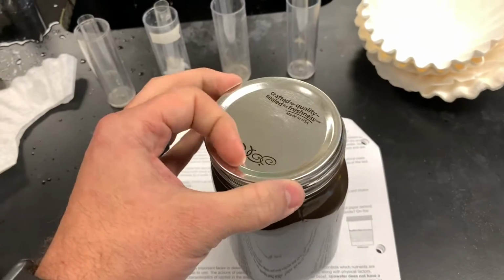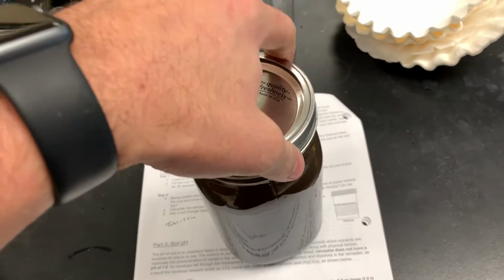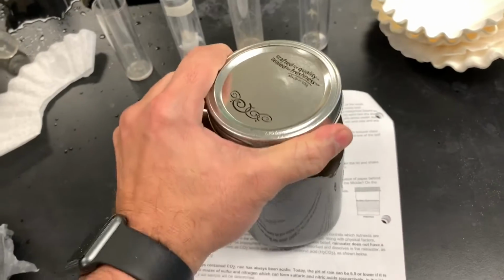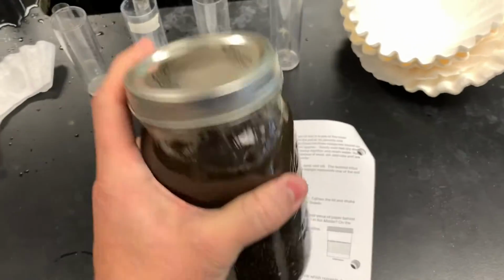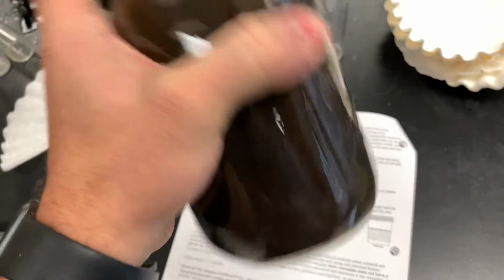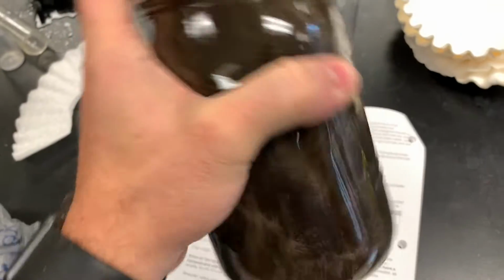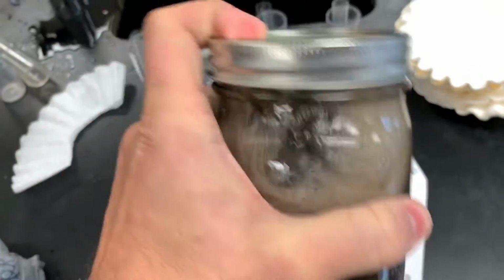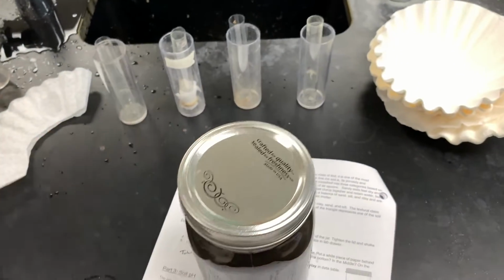So we put a little bit in there, cap our jar here, and screw this on. And so then what we do, once it's sealed in there good, is we're going to shake it vigorously for about a minute or so. Really get those churned up in there. Okay.